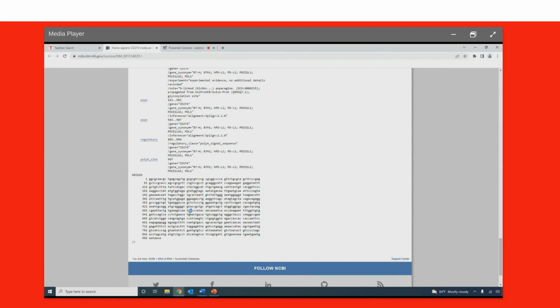And since we know that we're going to generate a 77 base pair long amplicon, you can go 77 bases upstream, 77 bases downstream, and you're going to generate a sequence or a context sequence. It's going to be 154 bases in length, and that's what is referred to as a padded amplicon sequence.